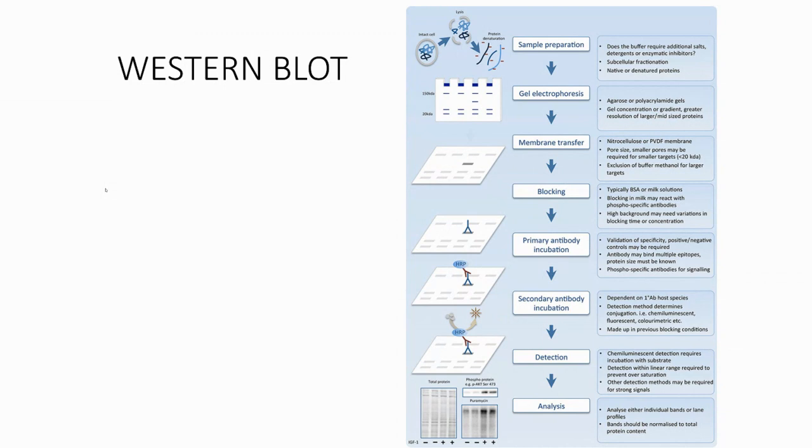And then when you apply the electric field, they can migrate like DNA from negative charge to positive charge. Because they are all primary structure and coated evenly with the negative charge, the migration distance will be inversely related to their size. All right, so that means the large protein will migrate slower with shorter distance, smaller protein migrate longer distance. Okay, that's the protein SDS-PAGE gel.